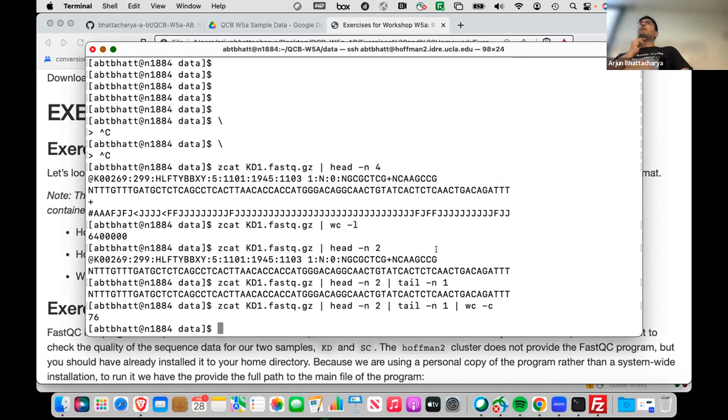This is why in the 2010 to 2015 range, people were doing a lot of work on this. It's a huge problem for transcriptomics. The concept of a multi-mapped read is essentially what you're talking about: does this read belong here in the genome or here? How can we tell it apart? And what do we do when they do map in different regions? Salmon and Kallisto kind of deal with that. We'll talk about what happens when we can't distinguish it tomorrow.